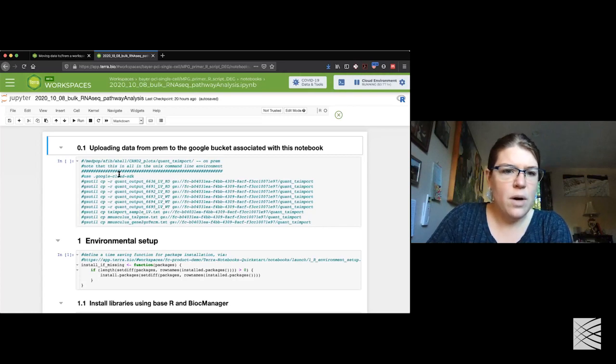Okay, my notebook is copied over into the cloud environment, and we're ready to start. I'm just going to give you a little preamble.